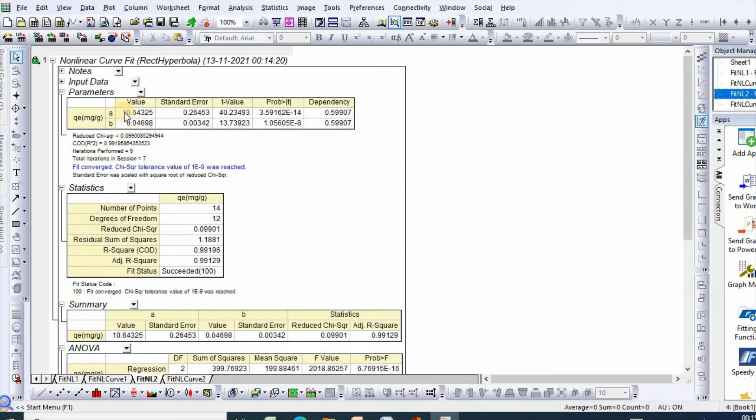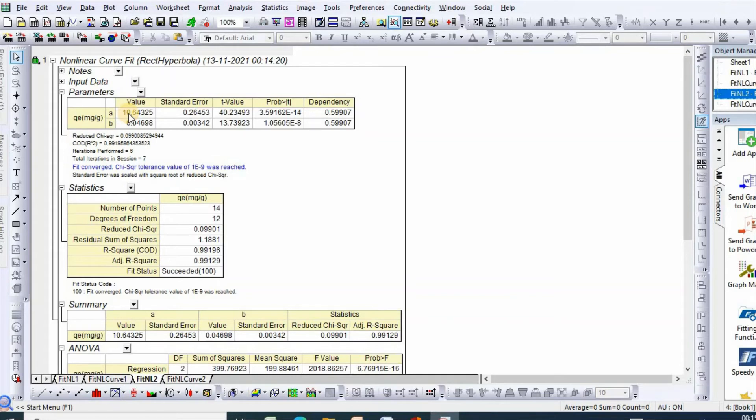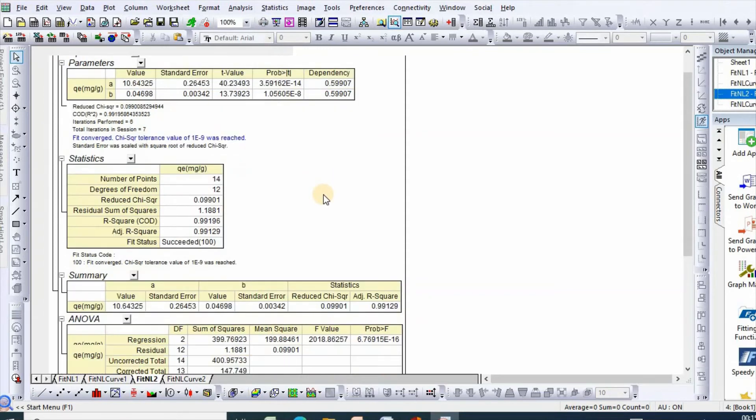We should include plus minus standard error values with qm and KL. This is standard error. Second comes statistics.